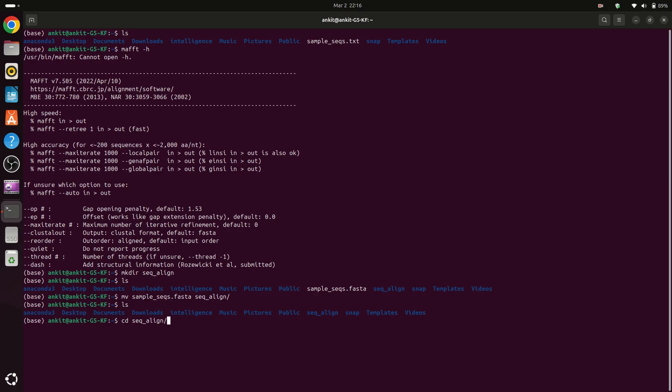So change your path. Then we can see that we have sample_sequences here. Now clear the terminal because we don't need this much to see.